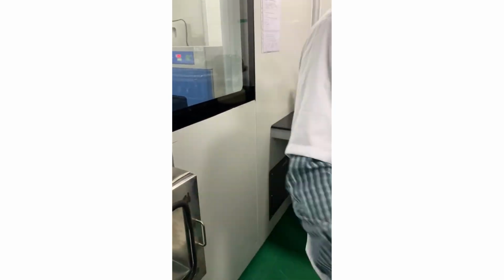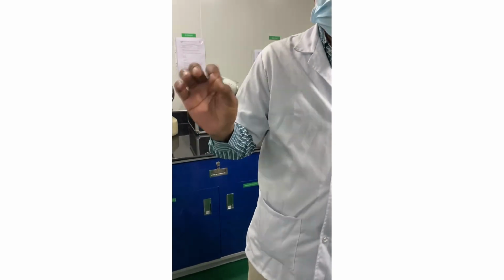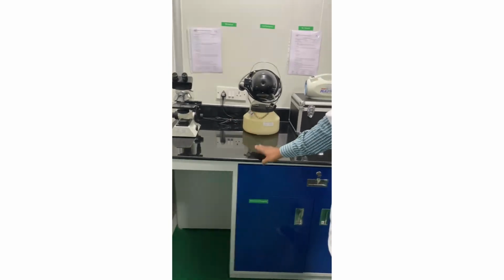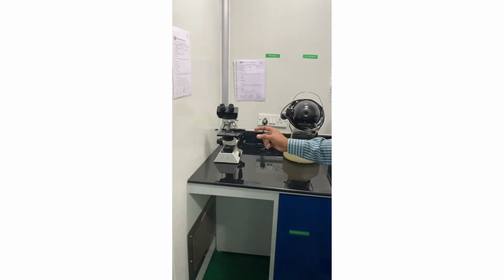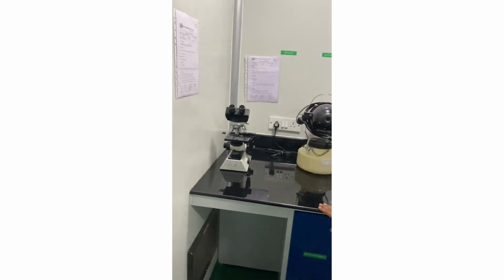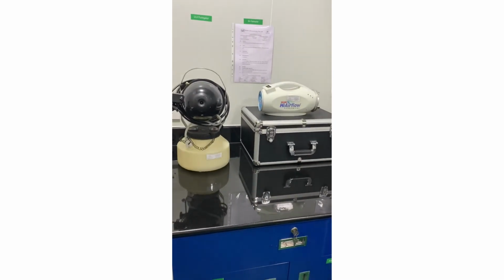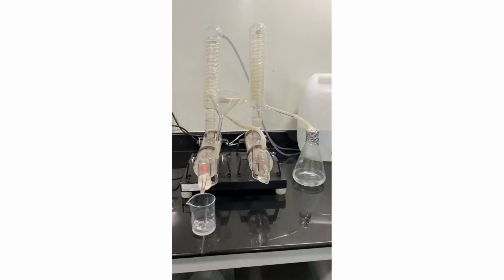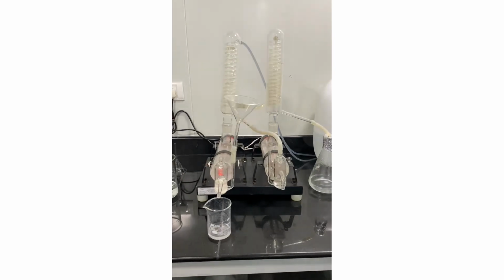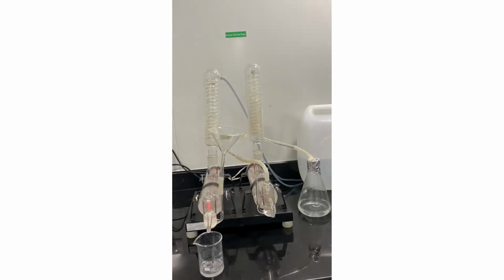From this pass box, we are taking the plates, and if any confirmatory test is needed to confirm a particular organism, we perform the confirmation test here. We identify the microorganism by using a microscope. This is a double distillation water unit. We distill the water here itself for preparing the media for testing purposes.